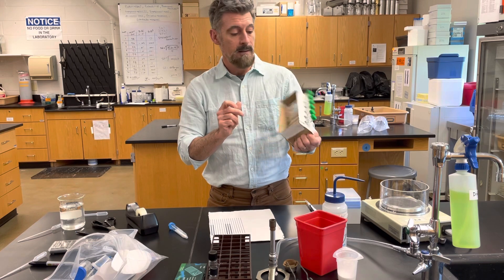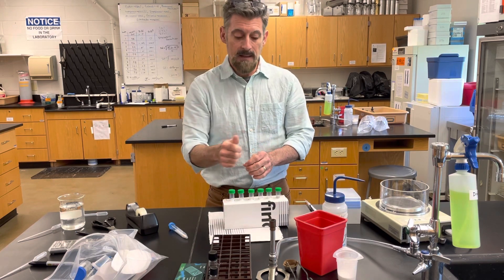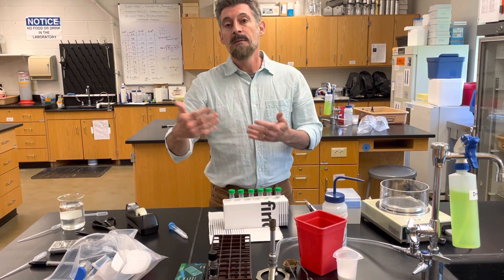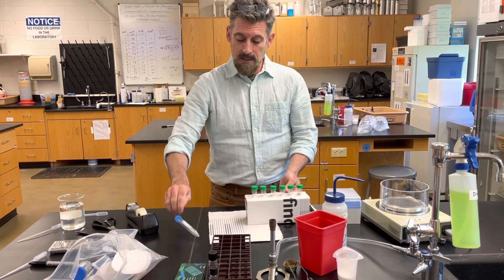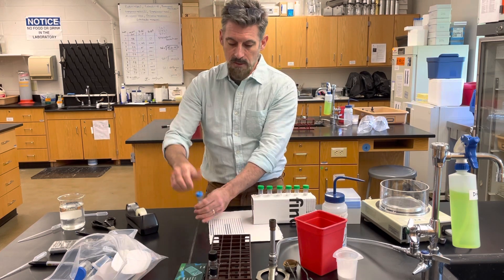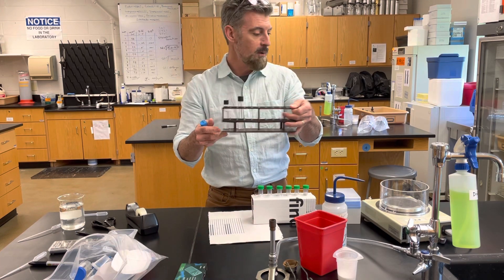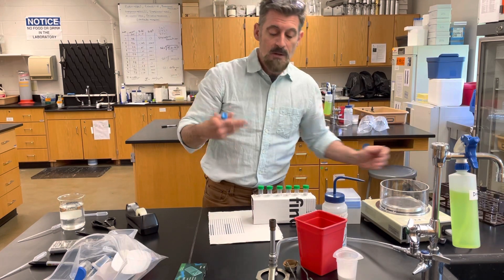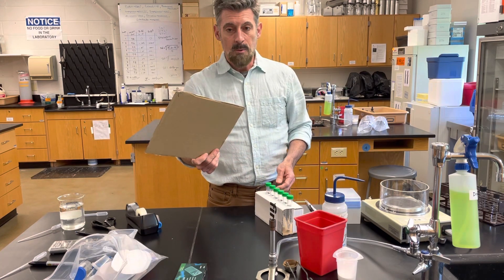You need to make a little test tube rack so you have a way of holding all these test tubes and pipetting liquids into them for serial dilutions. If you just try to hold them up they're just going to fall over. In a laboratory we would have a normal test tube rack, but you're not going to have that at home, so you need to make one.